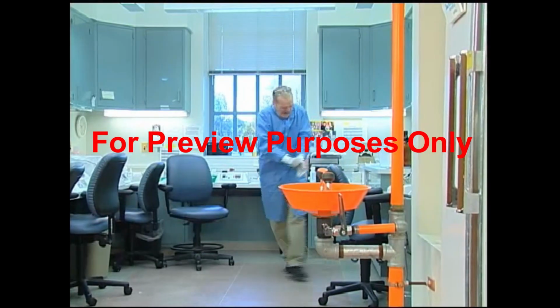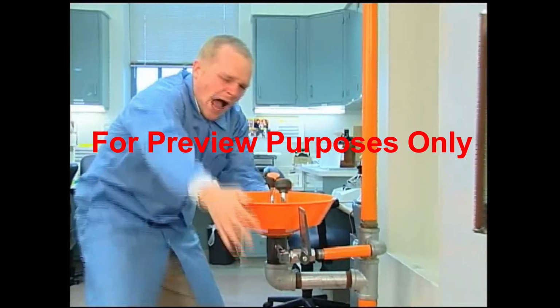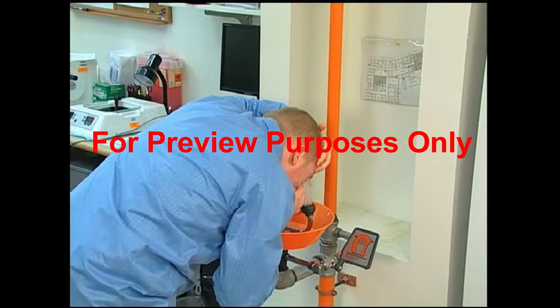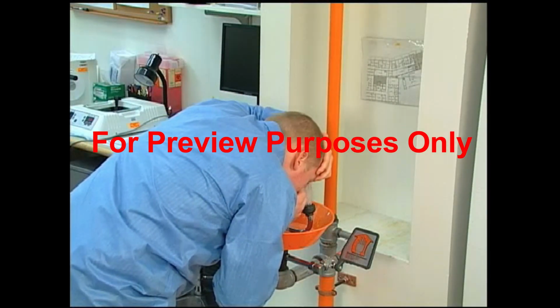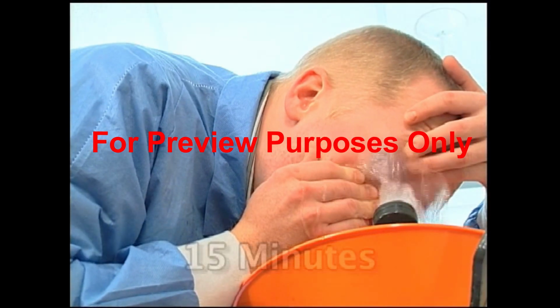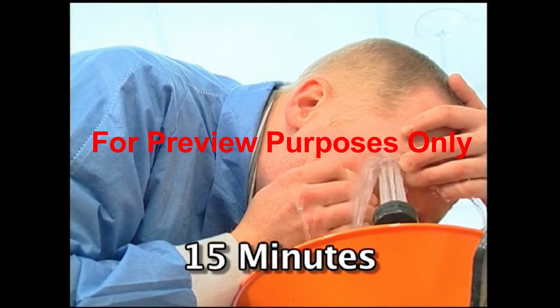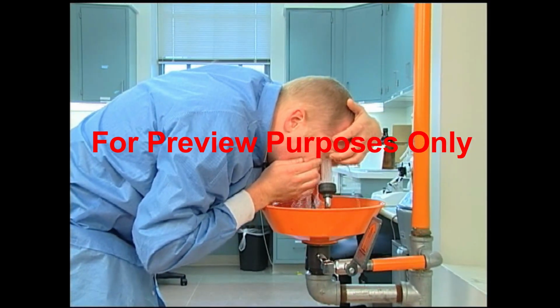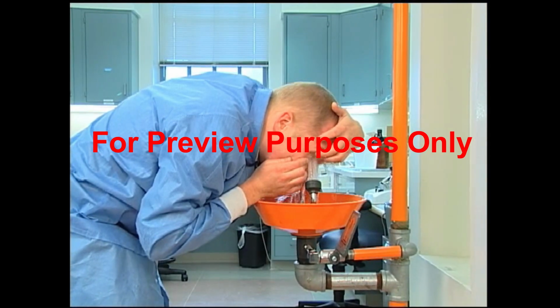If formaldehyde splashes into your eyes, water is again the first line of defense. Immediately go to your lab's eye wash station and wash the formaldehyde out of your eyes. Stay in the water for a minimum of 15 minutes. Hold your eyes open with your fingers to make sure the water covers the entire area. Then get medical attention as quickly as possible.